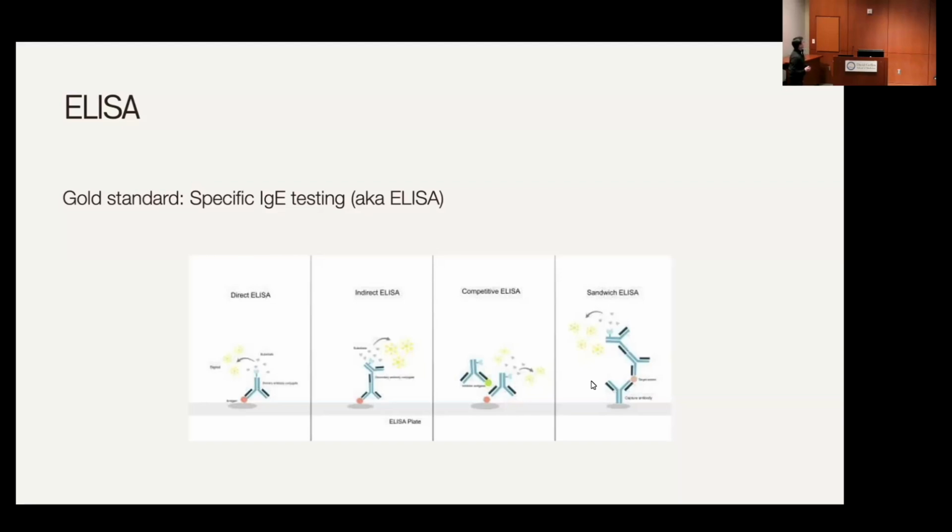Finally, in the sandwich method, we're primarily interested in looking for antigens, and this is in contrast to the indirect method where we were interested in looking for antibodies. In the sandwich method, we start by plating the bottom of the well with the antibody that has the capacity to bind to an antigen of interest. We'll add some kind of sample like serum or urine. And if the serum is positive for the antigen, we expect it to bind to the antibody coating the plate.